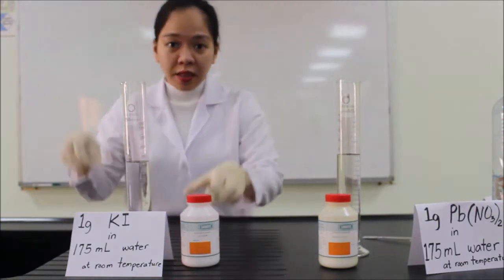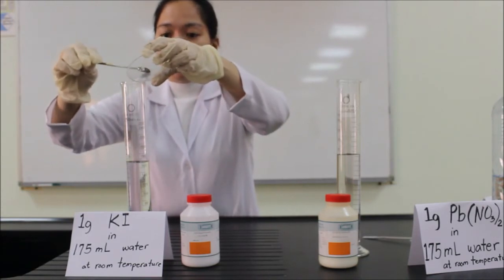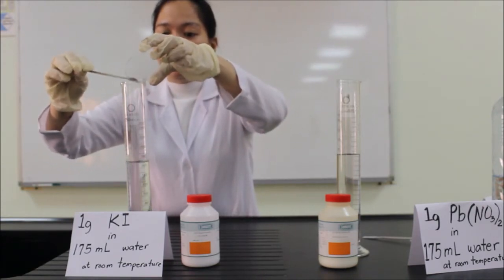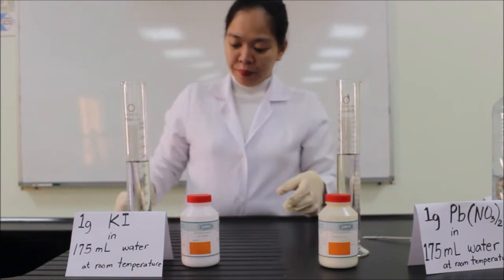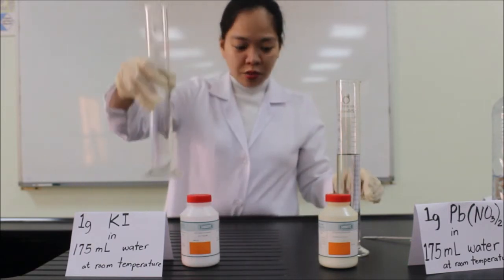And here is the 1 gram of potassium iodide in 175 ml of water at room temperature. And wait until it dissolves.